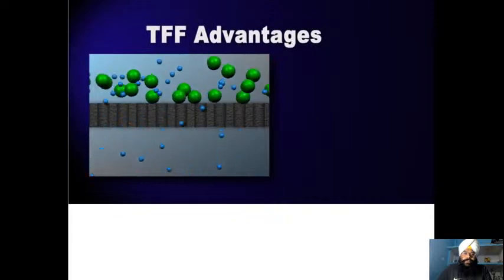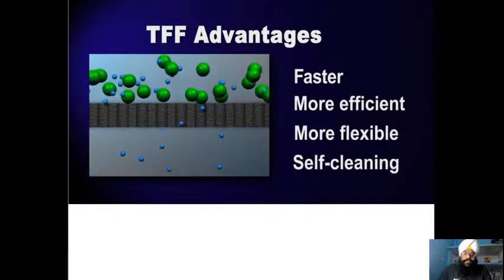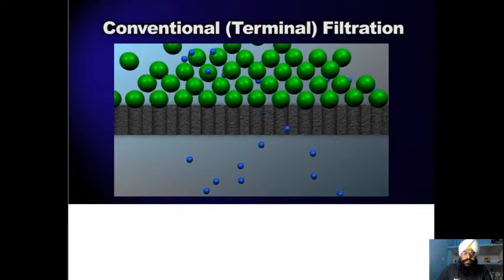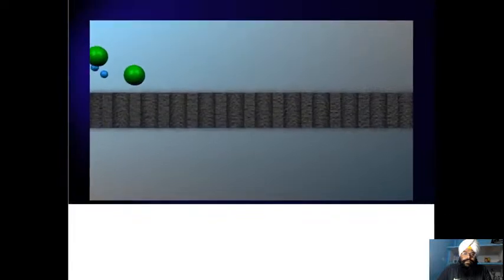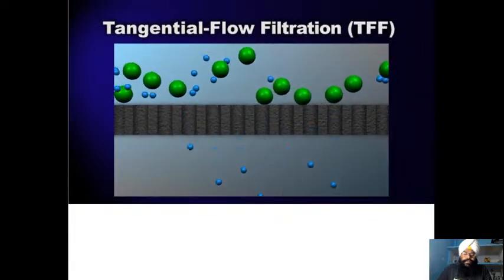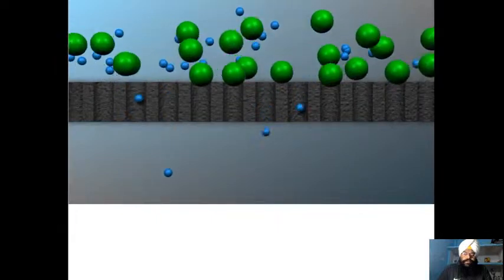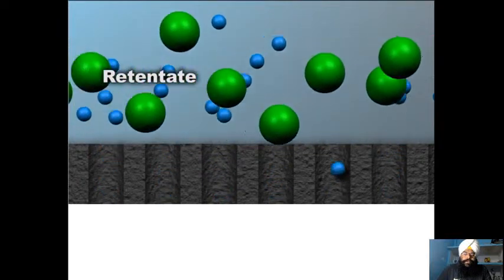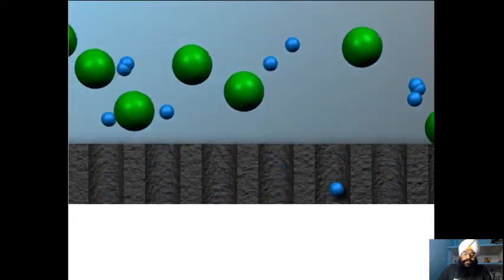What makes TFF different is a core technology that enables it to be faster, more efficient, more flexible, and even self-cleaning. In conventional or terminal filtration, a fluid is pumped directly into a filter. The particles within the stream that can't fit through the pores of the filter build up at the filter surface, eventually clogging it. In tangential flow filtration, the stream moves across the filter, that is, tangential to the filter, instead of directly at it. The cross-flow current actually picks material back out of the filter media or membrane and into the stream. This retained material, called retentate, is recirculated to the supply tank and will continue to loop through the filter for as long as the process runs.